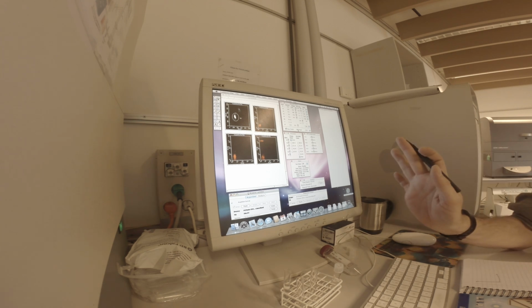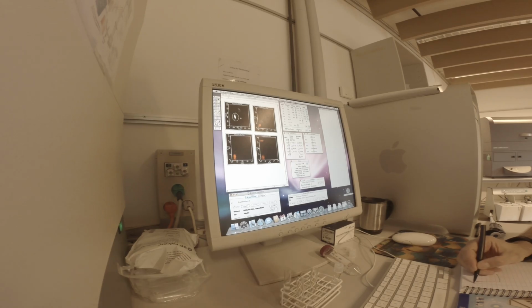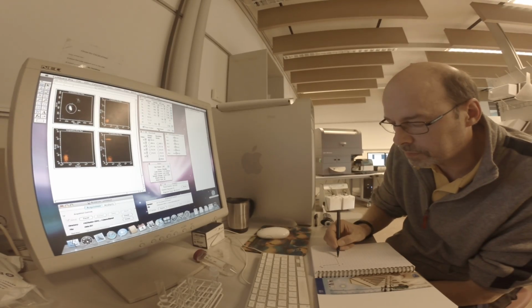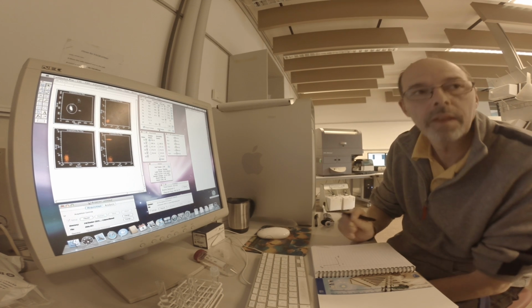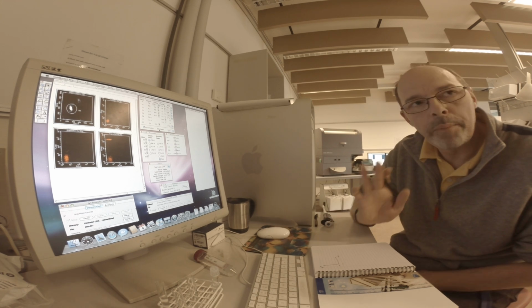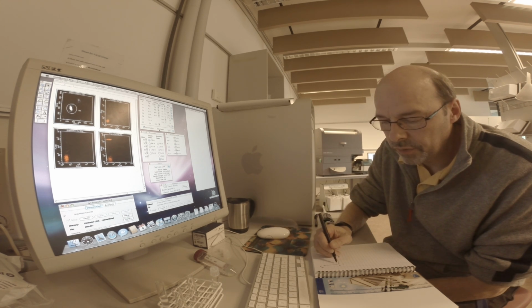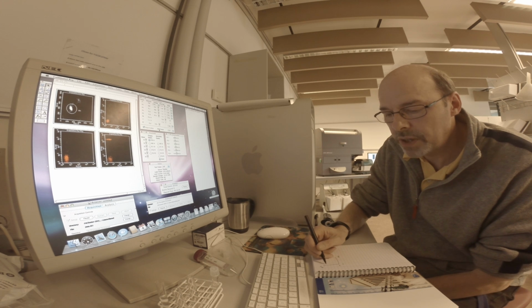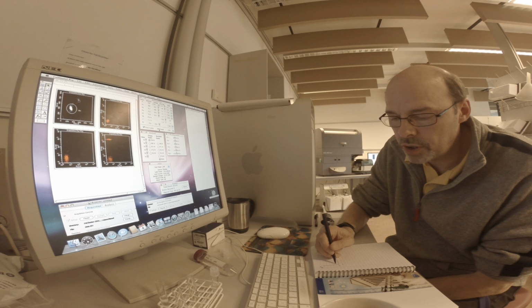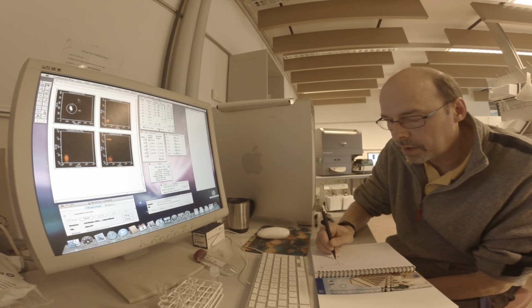The way this machine is operating is that it has 1,024 channels on each axis. And it doesn't matter whether it displays it logarithmic or linear, it's still 1,024 boxes. Bottom line is, for a cell to lie up here, it must have some kind of number. Yes? That's right. And a much lower number when they're lying in here.